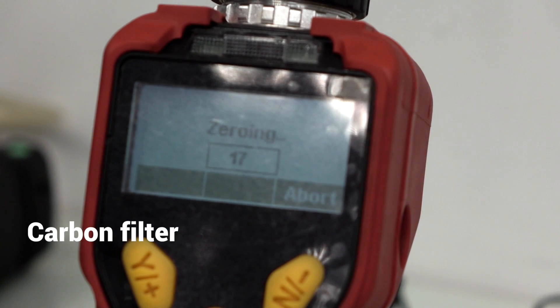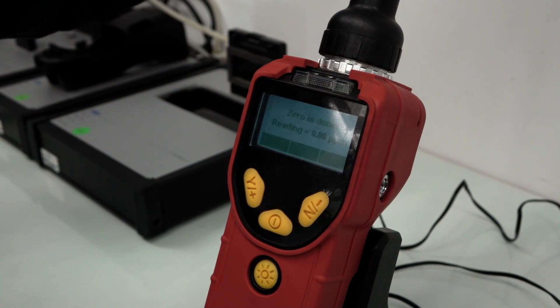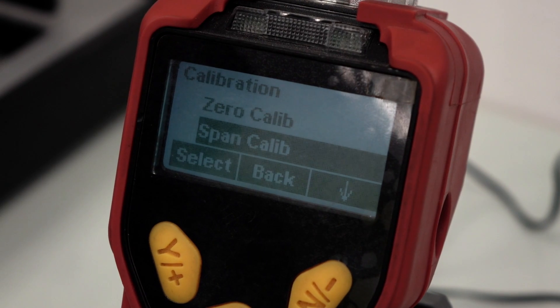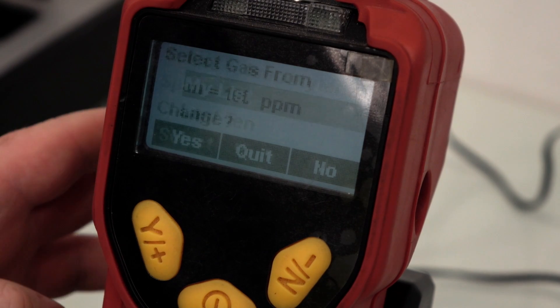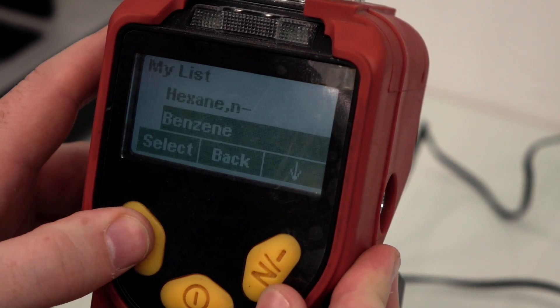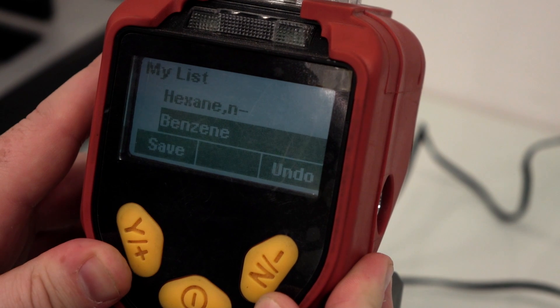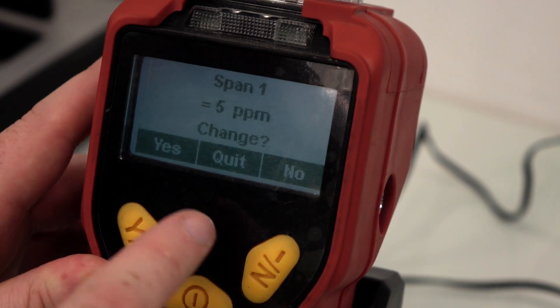When performing the span calibration for benzene, ensure that you select benzene as the target from the menu and that the concentration displayed matches the concentration of the calibration gas you'll be using. After selecting the target gas, set the benzene separation tube into the probe.